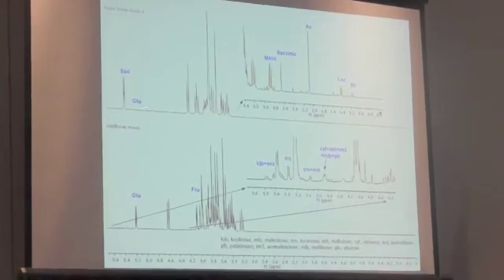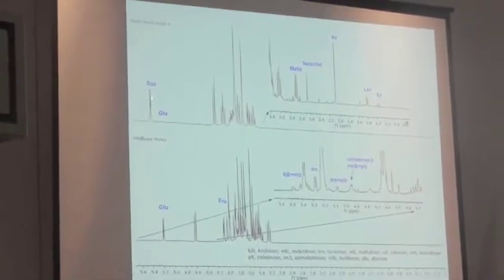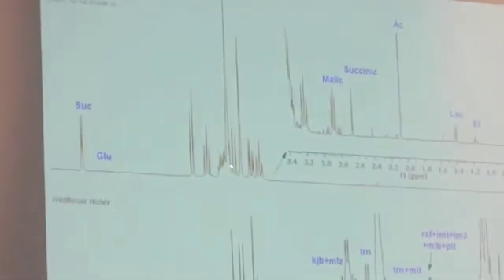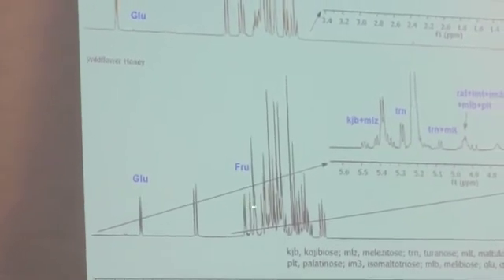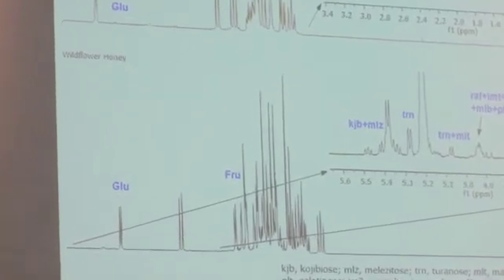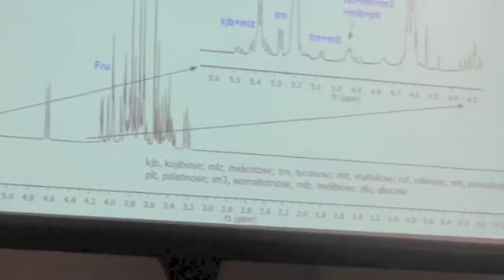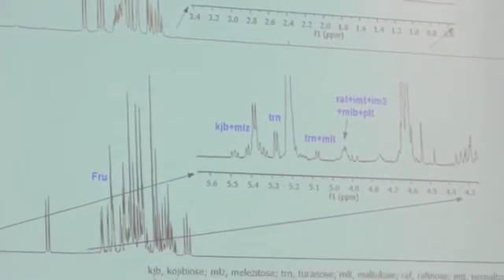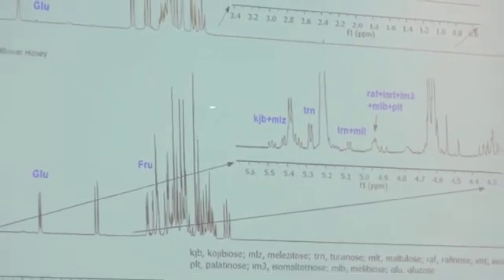And then this is, if you wanted to throw in maple syrup, for example. So maple syrup, there's a lot of sucrose, a tiny bit of glucose, no fructose. If you look at honey, there's glucose and fructose. There's literally no sucrose. So they actually use this in Europe to prove that people are putting invert syrup into honey at like 20-30% and getting an economic boost from that and selling you cheap stuff at honey price.